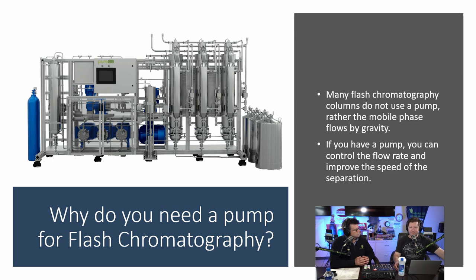And in fact, a lot of organic chemists will use that to prepare maybe half a gram pure quantities of whatever they made. Because it takes longer if you're not using a pump, it takes a lot longer. And there's a whole skill to packing and everything. But if you're in the laboratory and you want something quick and dirty and you don't want to do a whole entire separation, you're only doing it once to show that, hey, I did this once, like an academic, then you can definitely not use one of these. You use something more manual.